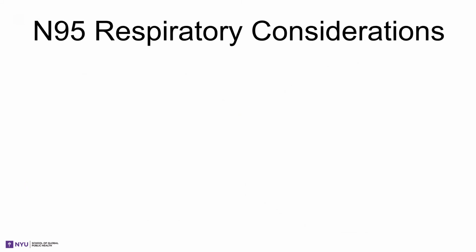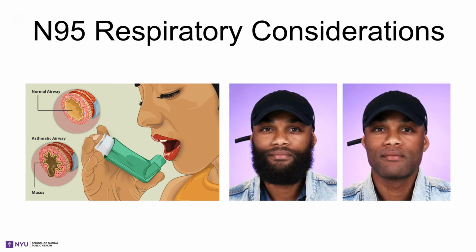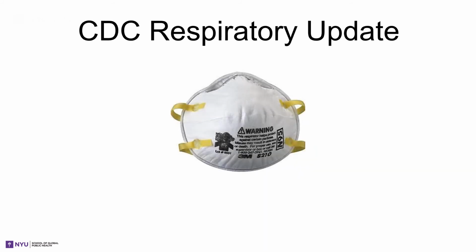When wearing an N95 respirator, recognize medical signs, symptoms, and conditions that may limit or prevent you from wearing a respirator. Some examples are as follows: respiratory ailments, anemia, diabetes, epilepsy, and cardiovascular impairment. Some others are facial hair, comfort, vision, claustrophobia, and a punctured eardrum. Regarding respirators, make sure to keep track of the requirements for federal OSHA or your state OSHA's respiratory protection standards and any CDC updates.